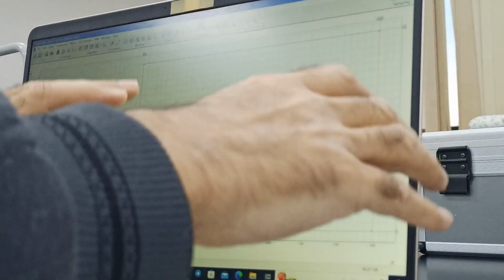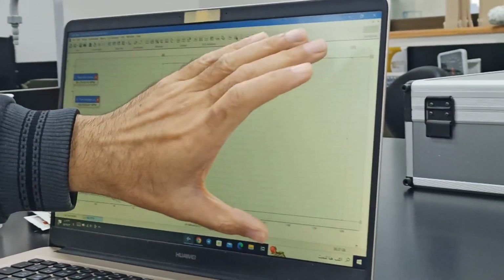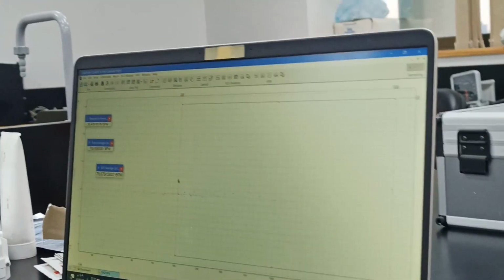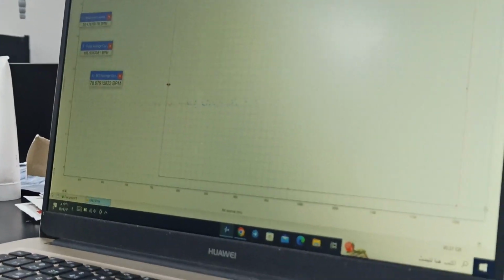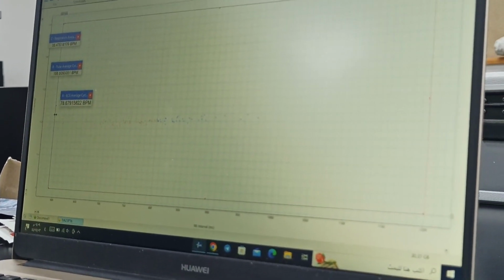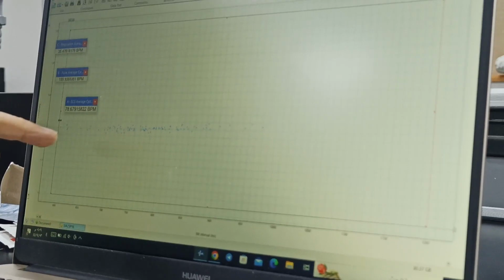So now this is a box that the program in a default setting is just including these beats. What we are going to do is extend this box up till here. Okay, so all of them become blue.